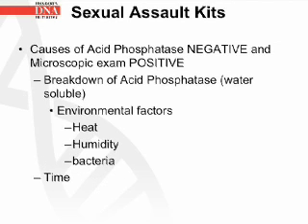Causes of acid phosphatase negative and microscopic exam positive is the breakdown of acid phosphatase, which is water soluble, and it can also be due to environmental factors such as heat, humidity, and bacteria. Also, acid phosphatase breaks down over time.